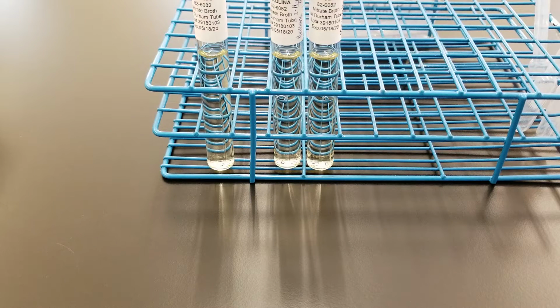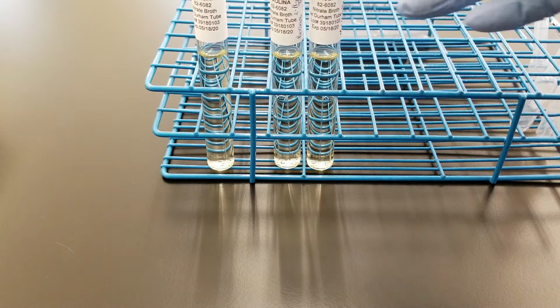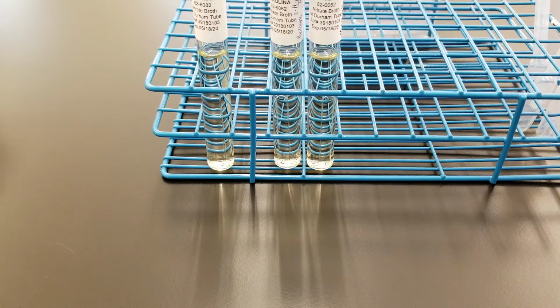So the Neisseria we have in our lab is Neisseria meningitidis and Neisseria lactamica, and the Moraxella we have, the only Moraxella species that is gram-negative cocci, diplococci, is the Moraxella catarrhalis. All the rest of them are cocobacilli or rods, and they're not really very virulent, and you don't see many infections from them.